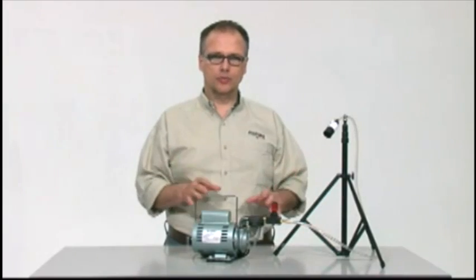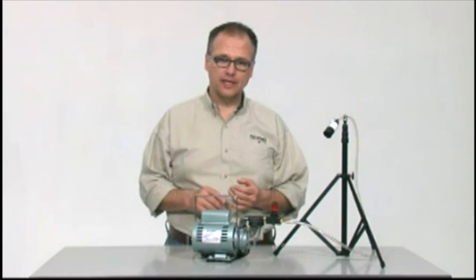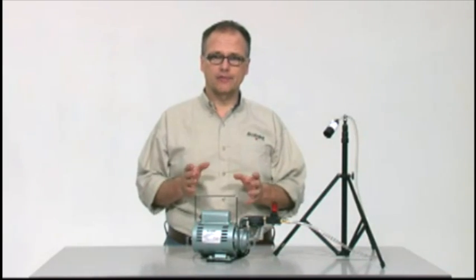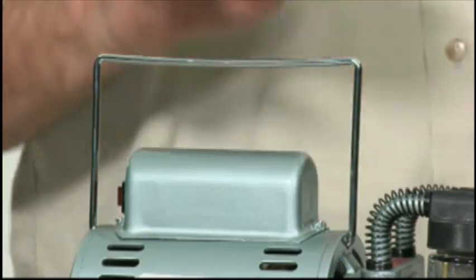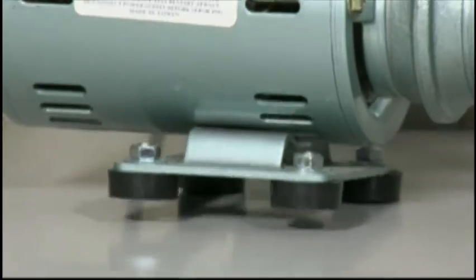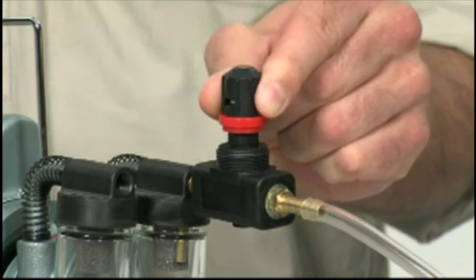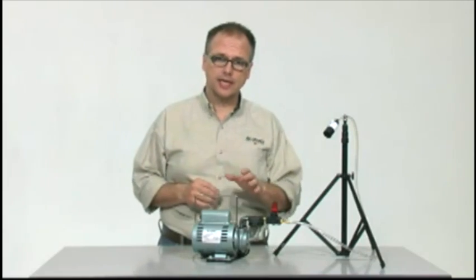The Allegro Rotary Vane Pump uses carbon vanes that operate on a rotor providing a smooth consistent draw of air. The pump includes a handle, padded feet, an on-off switch and adjustable regulator to adjust airflow. The unit is very compact which makes for quick and easy transport and setup.